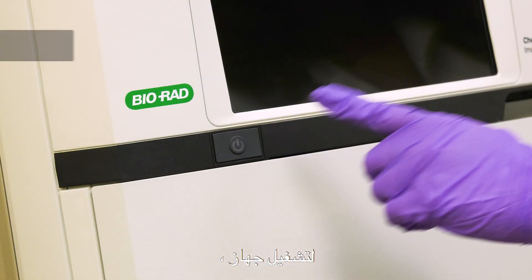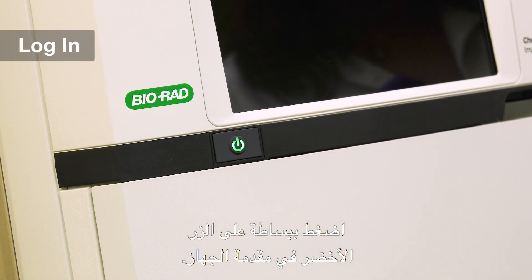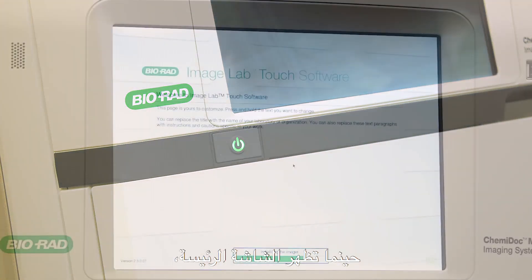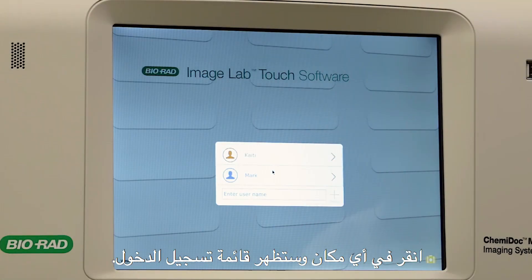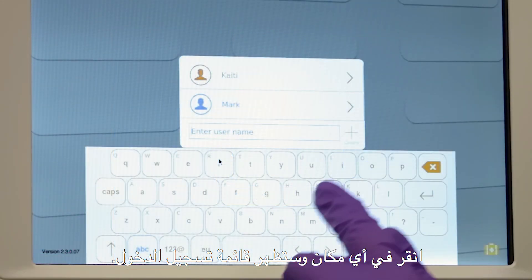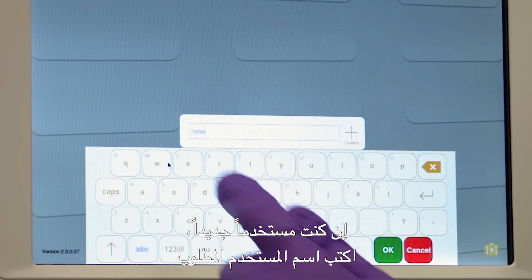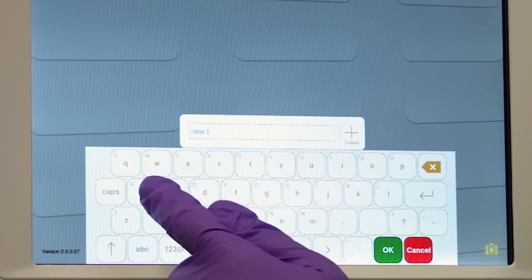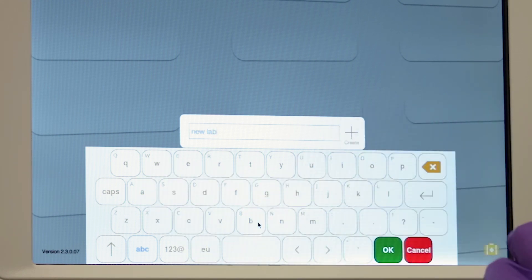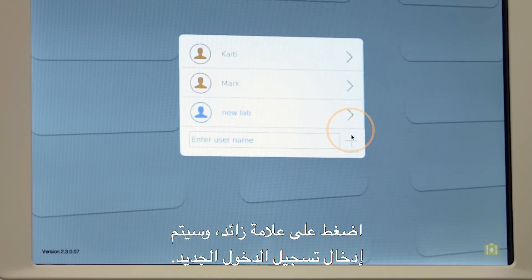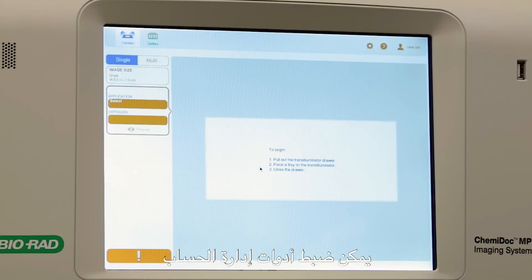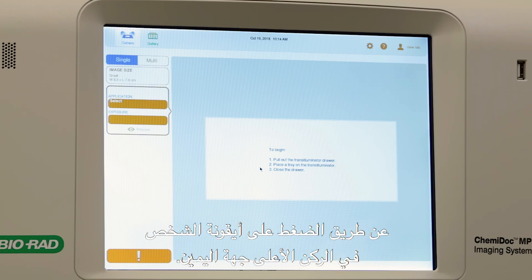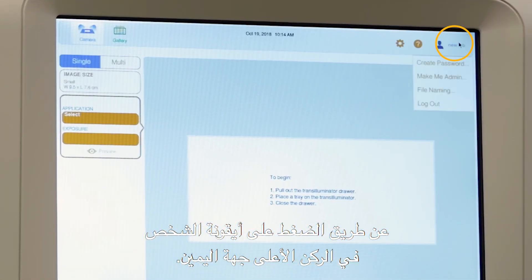To turn on your Chemidoc, simply push the green button in front of your instrument. When the customizable home screen appears, tap anywhere and your login menu will appear. If you're a new user, type the desired username, click the plus sign, and the new login will be entered. Administrative controls can be set by clicking the person icon in the top right-hand corner.